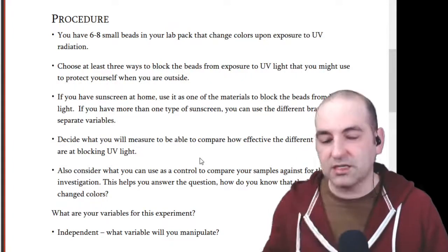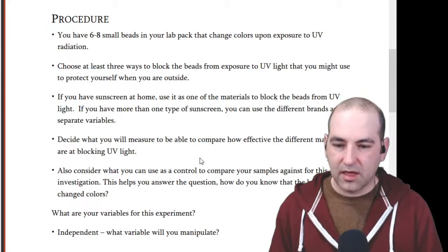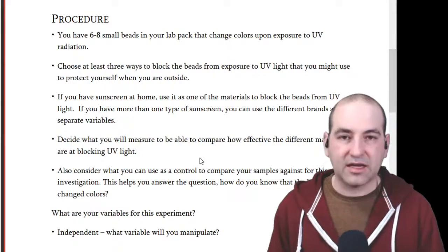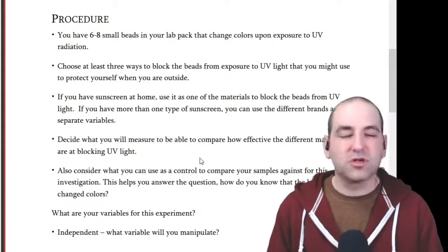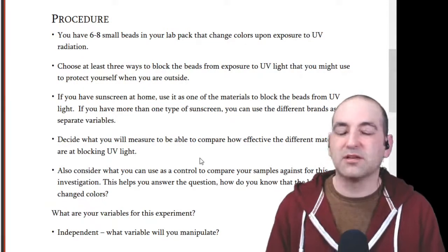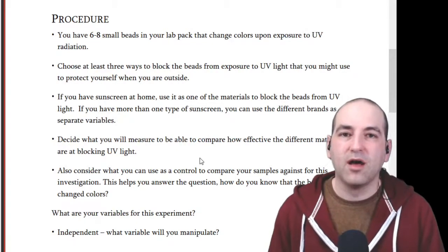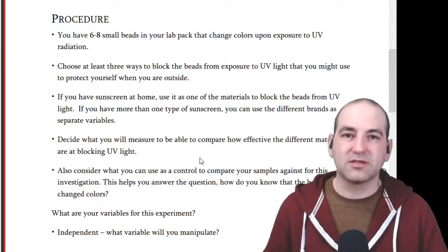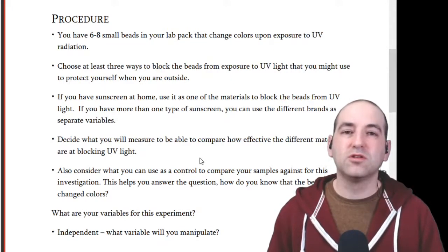So if you have already done this without listening to this, and you had that experience where it sort of worked, but maybe not great, just go do some more tests. I assume you still have your beads. They're not destroyed in this experiment. You can wipe the sunscreen off of them or wash them off. Or, if you used fabrics and things, obviously that's not going to hurt them either. So, you can do this over and over again.